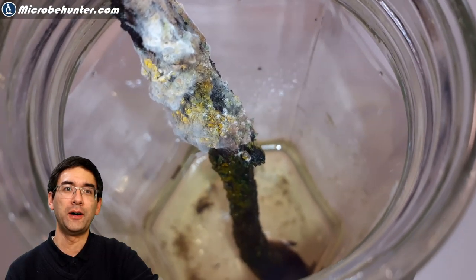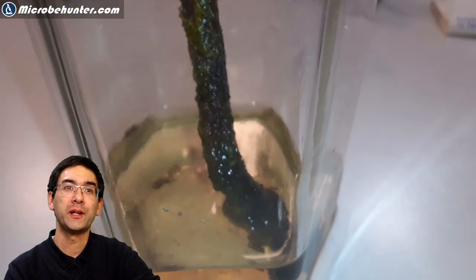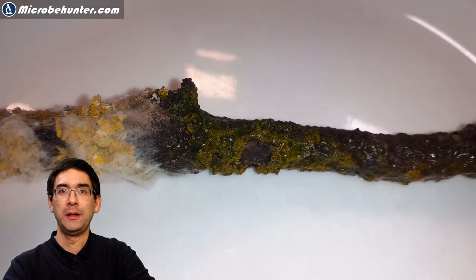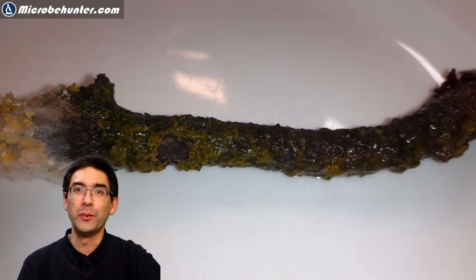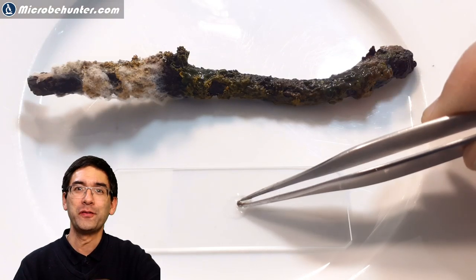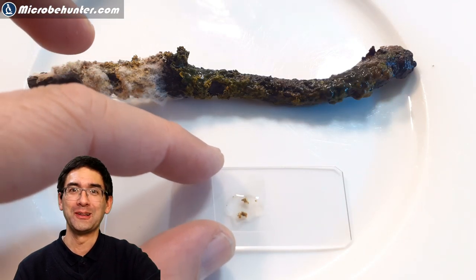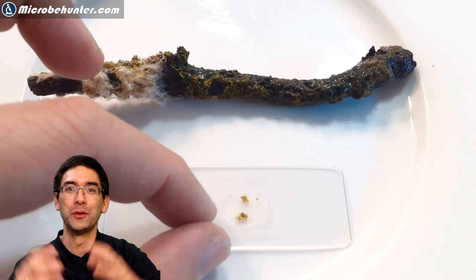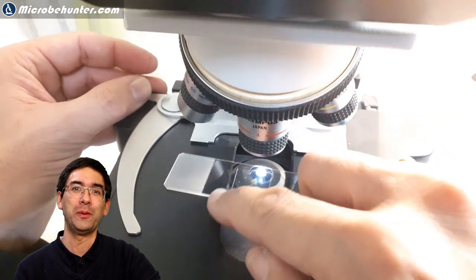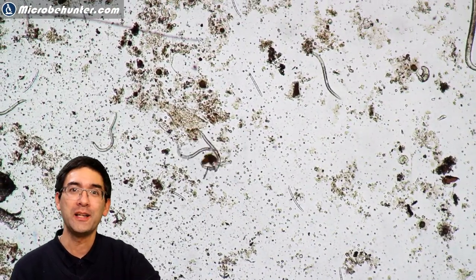This is where I found this little water bear. It's a rotten piece of wood that I placed into a jar of water so it does not completely dry up, and over a couple of weeks it started to turn slimy and started to smell pretty badly. So there was a lot of microbial activity going on. I took a little sample from the rotten piece of wood, placed it on the slide, cover glass on top, and everything went under the microscope — and I saw hundreds of tiny worms.